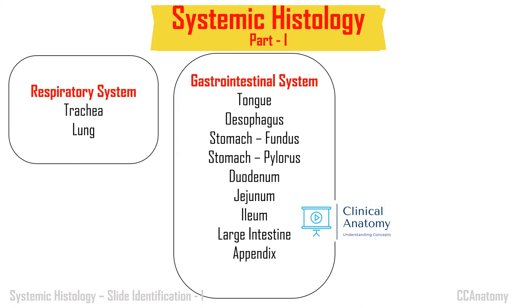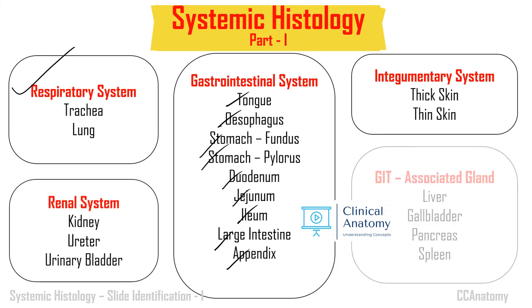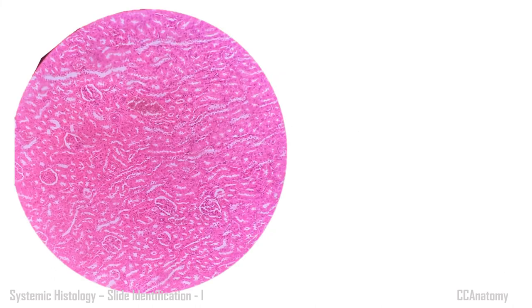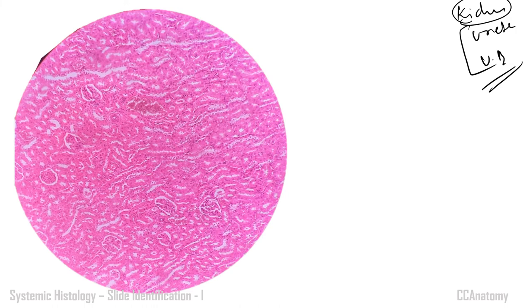We have now completed the respiratory system, GI tract (tongue, esophagus, stomach fundus and pylorus, duodenum, ileum, jejunum, colon/large intestine, appendix), liver, gallbladder, and pancreas — with spleen and the lymphatic system covered in the previous video. Now we are moving to the renal and integumentary systems. In the renal system there are three slides: kidney, ureter, and urinary bladder. Ureter and urinary bladder have transitional epithelium. The kidney is easily identified by locating the glomeruli.